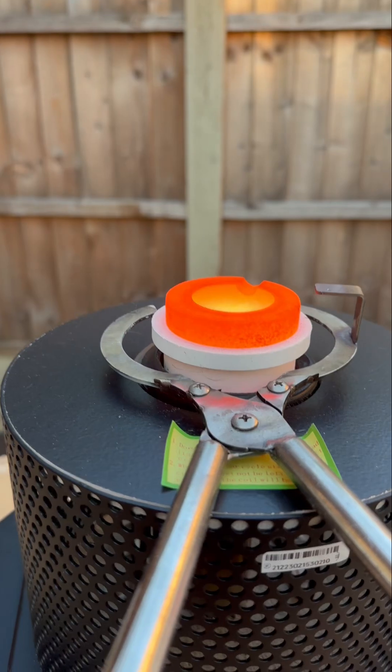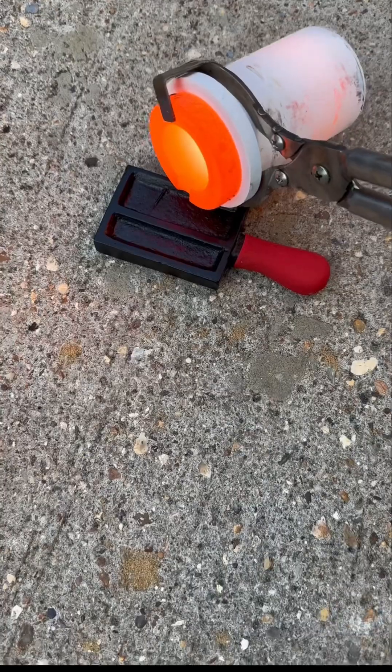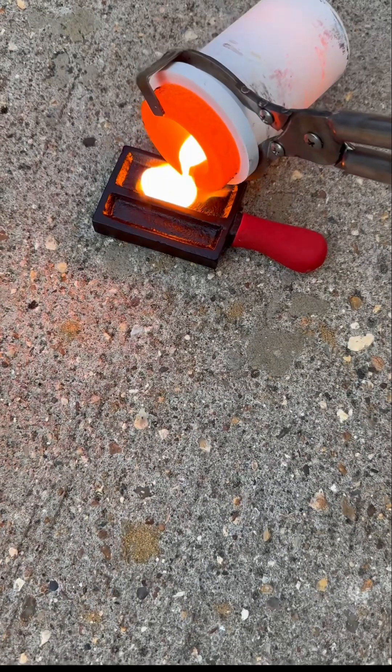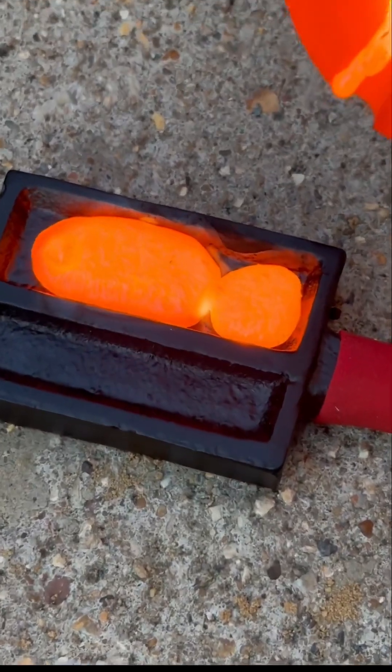So what we're going to do now is remove the copper metal from the furnace and then pour it into a mould. As you can see, it's bare hot — bare orange. It's so bright that it can actually damage your retina if you look at it directly.